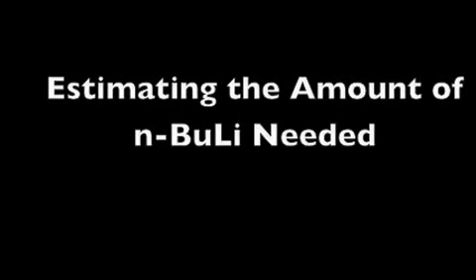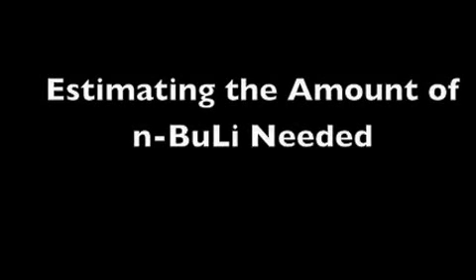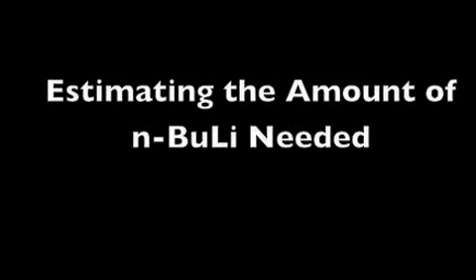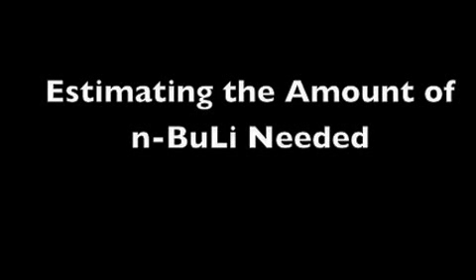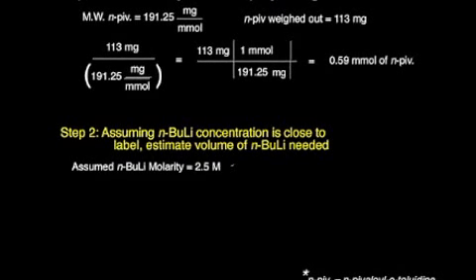Now we're going to estimate the volume of N-butyllithium needed for the titration. This is important so that we don't take up too much into the syringe and have a lot of waste N-butyllithium to get rid of. What we're going to do is assume that the N-butyllithium concentration is close to that on the bottle. The bottle lists a concentration of 2.5 molar, so we'll assume the actual concentration is close to that.